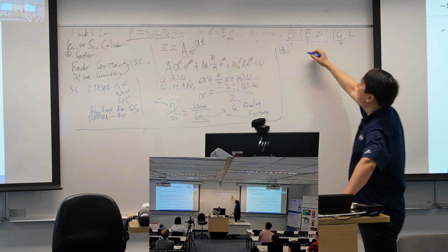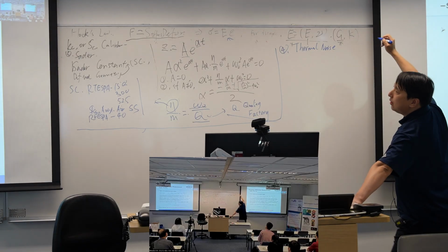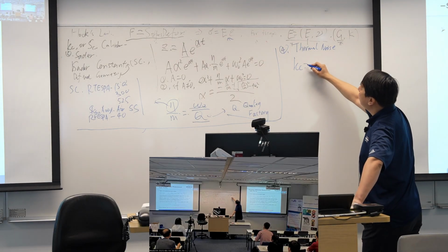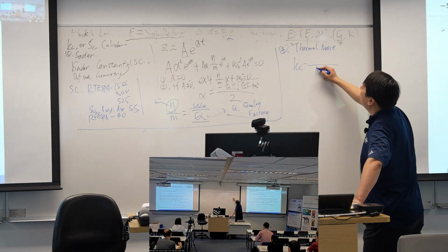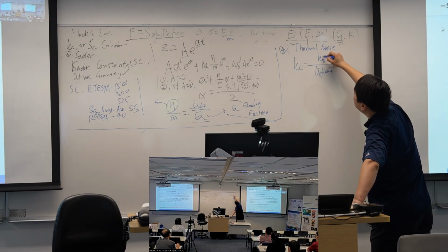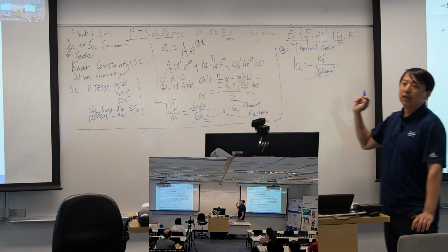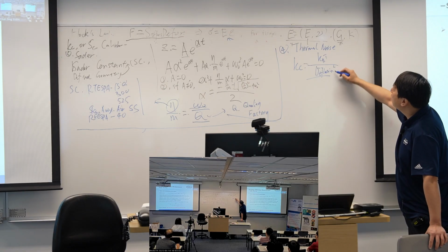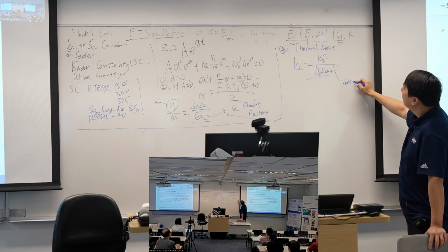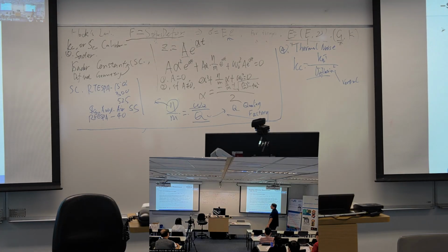Besides the Sader method, we have the thermal tune. The thermal tune is based on the spring constant equals kBT over the deflection squared. So we need to measure the deflection. But on AFM, we have to use the vertical signal to measure it. If our probe is hard, the vertical signal will be quite small, quite weak. So it's hard to measure the vertical values.